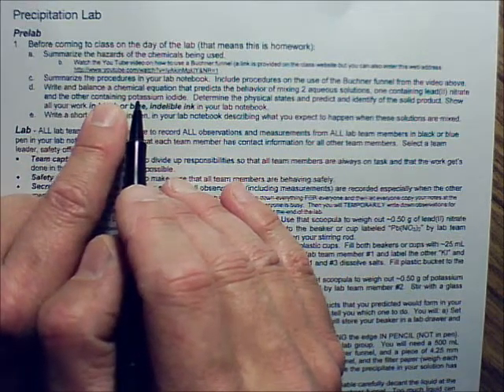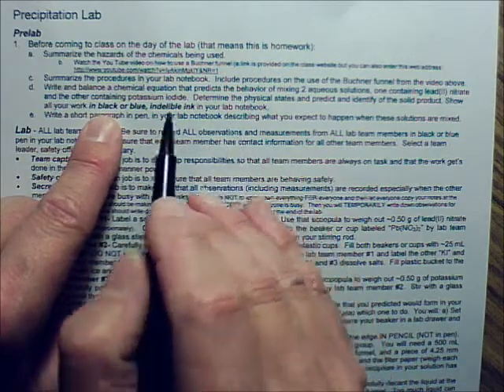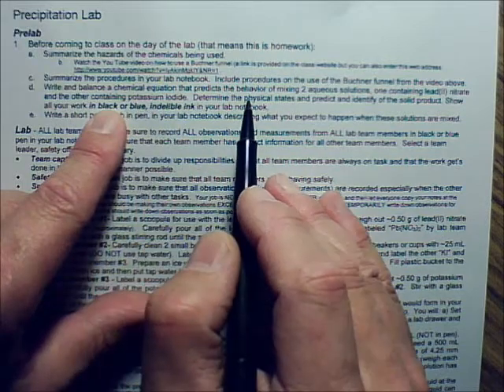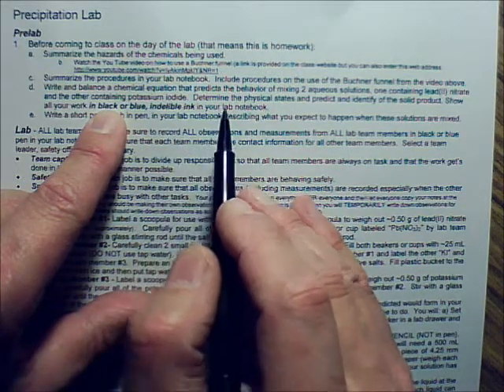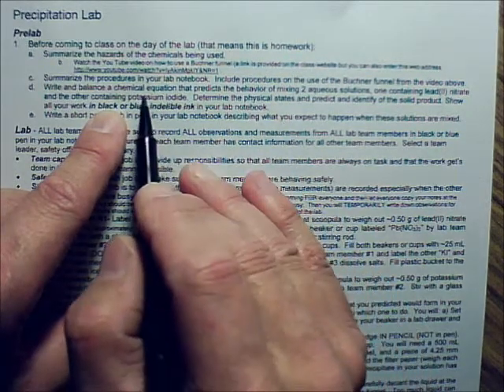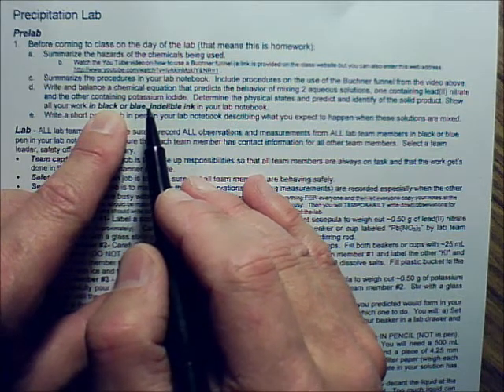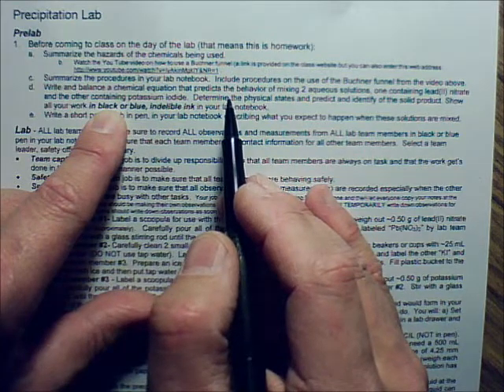One other thing you need to do in the pre-lab, getting ready for tomorrow's lab, and this needs to be in your lab notebook, you need to make sure you have a balanced equation. I would balance that on a separate sheet of paper and keep up with that. But then transfer the balanced equation once it's done to your lab notebook. You don't have to show the atom inventory in your lab notebook, just the balanced equation. Does that make sense? Everybody clear?